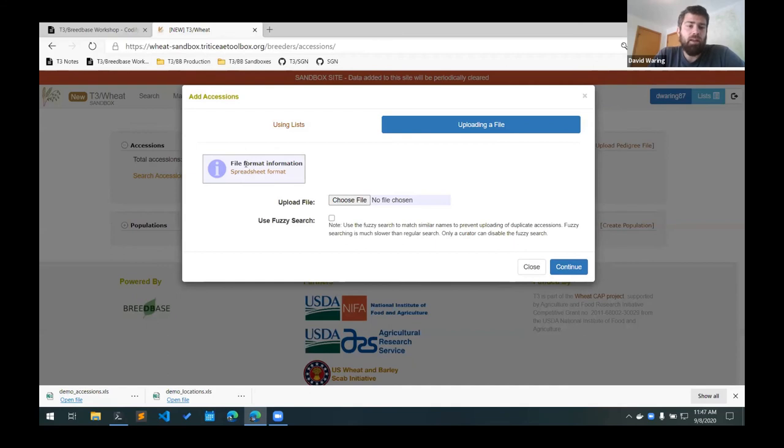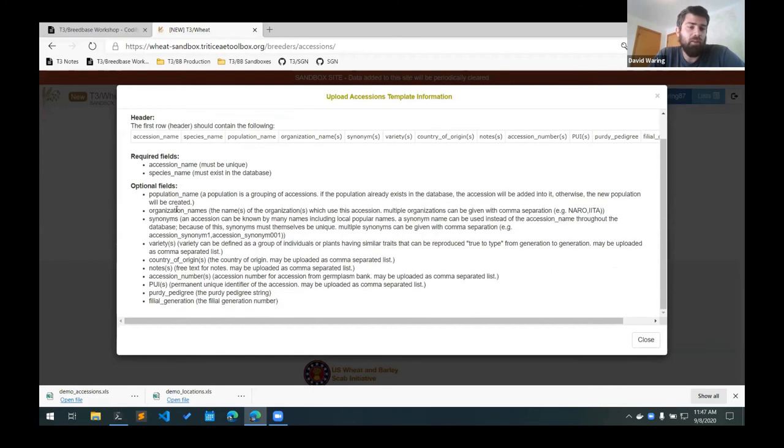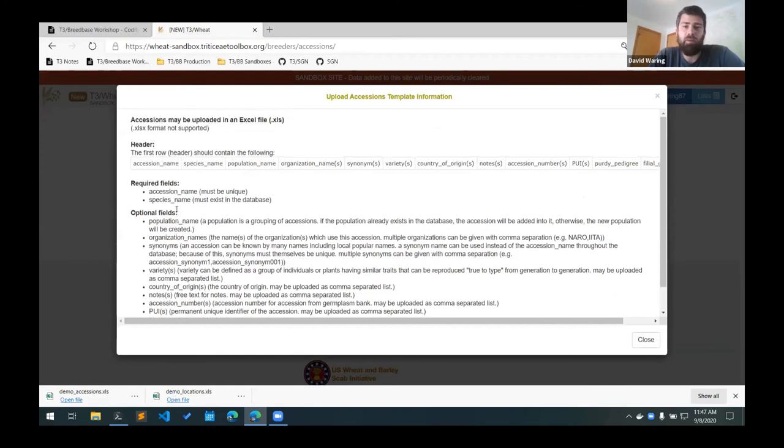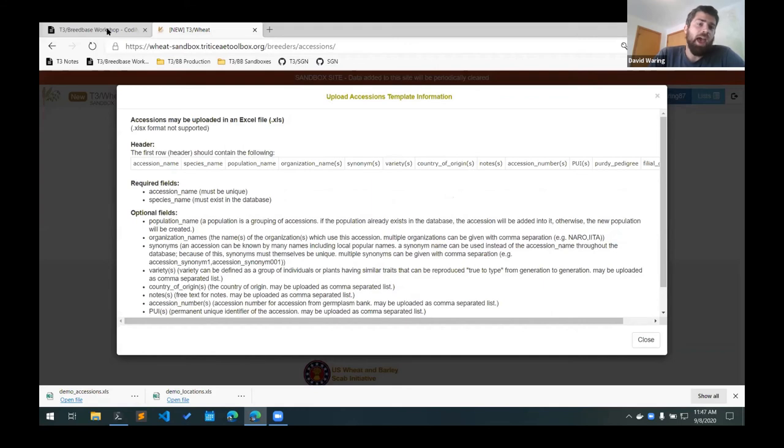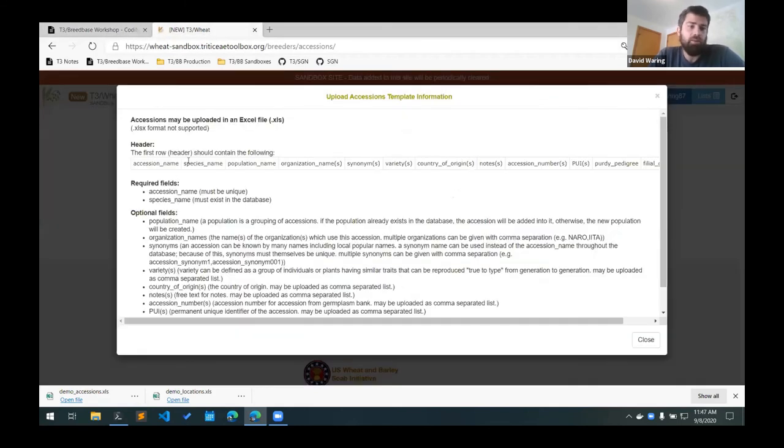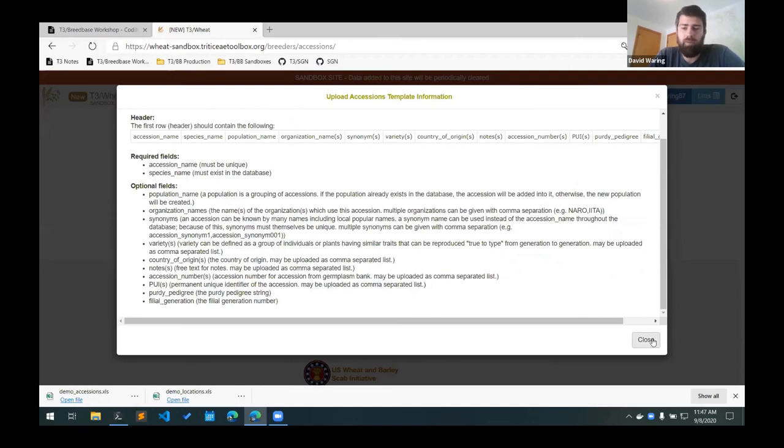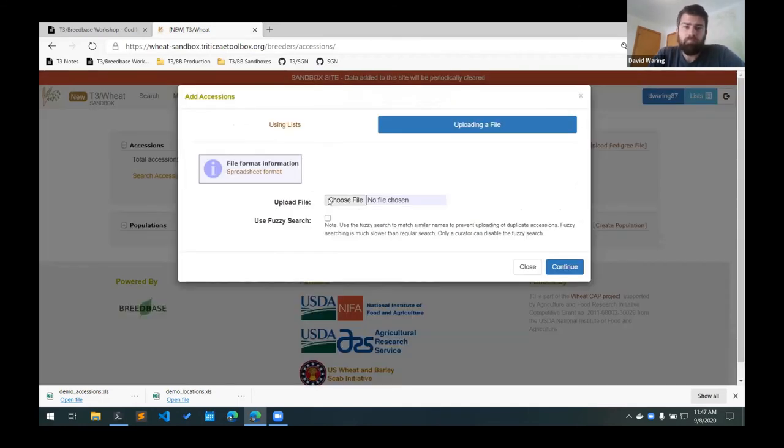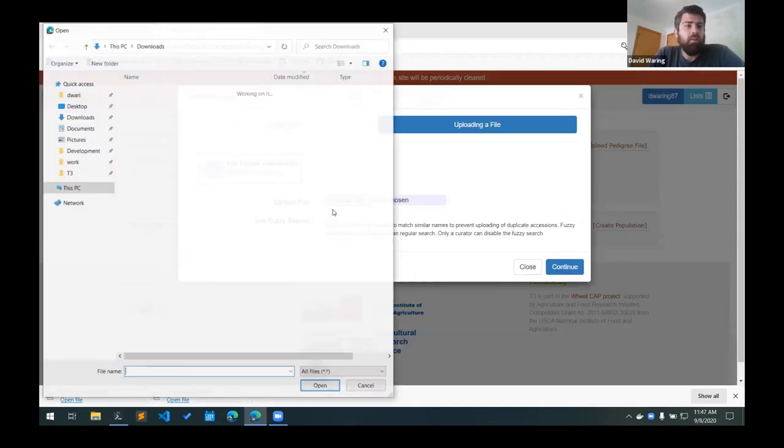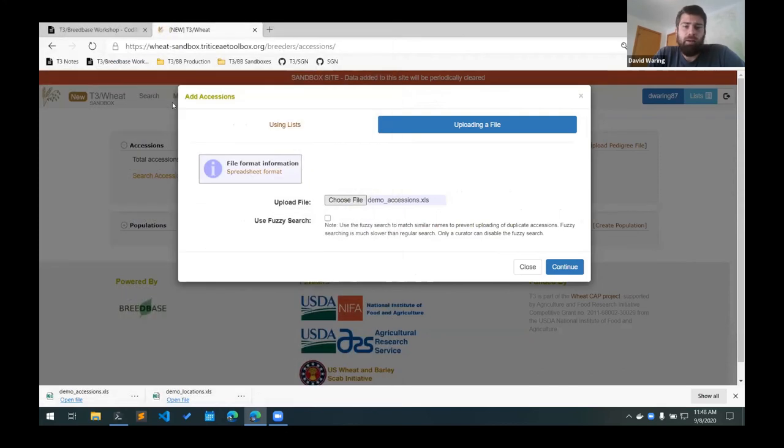And again, here on this upload dialog box, there's more information about the columns that are needed for that template. So all this information I have in the notes here, but it's also in all these upload dialogs as well if you need to refer back to it. I'm going to choose my upload template.